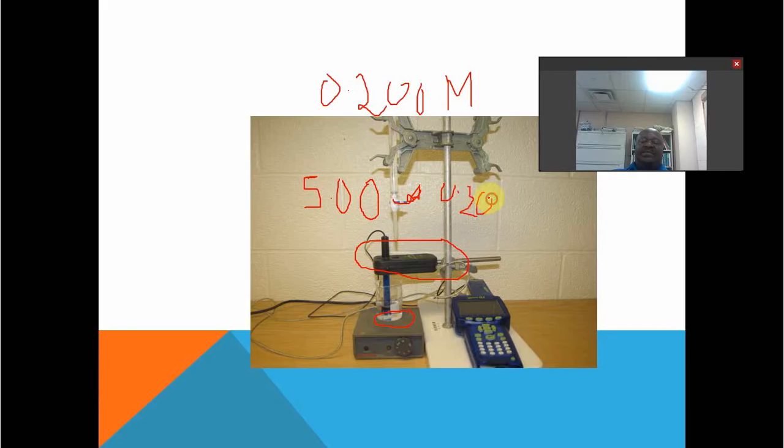So what you have is 1 millimole, 1 times 10 to the minus 3 moles of acid. This is a 1-to-1 reaction. So how many milliliters do we need to add in order to get to the equivalence point? It's quite easy to figure out that you need 5 milliliters as well. After all, these are the same concentrations, right? 0.2, 0.2. So you're then expecting equivalence points to occur at around 5 milliliters when and if they're present.